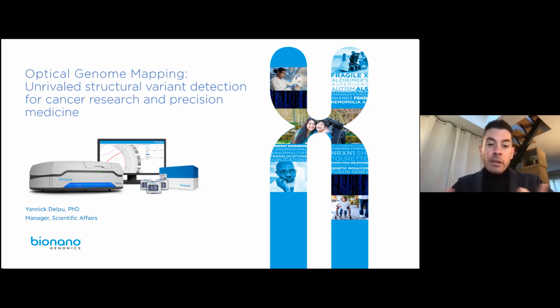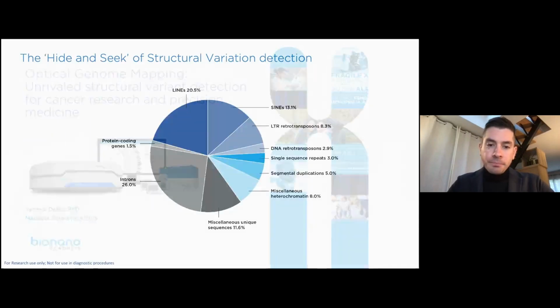Among all biological tissues, cancer is probably the most complicated to interrogate. Genome instability constitutes a major challenge for the characterization of such a sample by current technologies. And add to that the high cellular heterogeneity, the presence of many clones bearing different genetic alterations. This explains the limitation of NGS and how it led to a lack of understanding of the role of structural variation in cancer, which remains largely overlooked today.